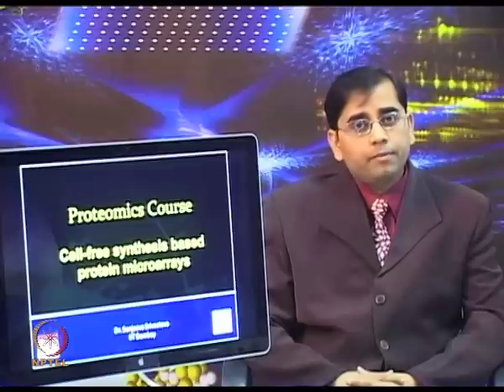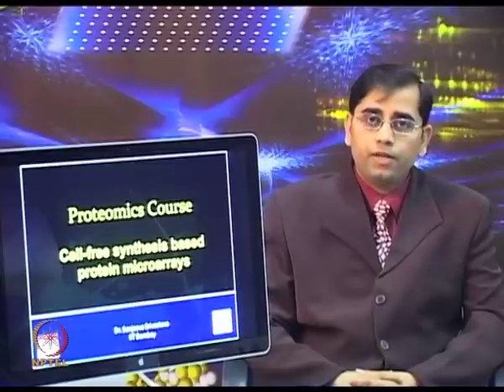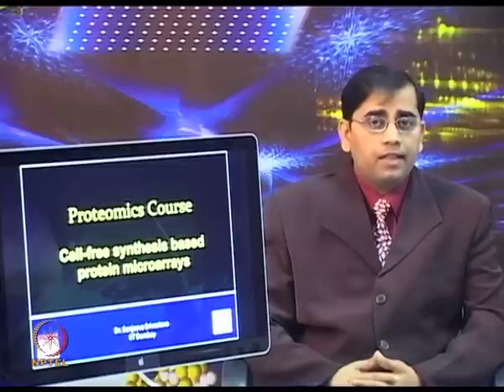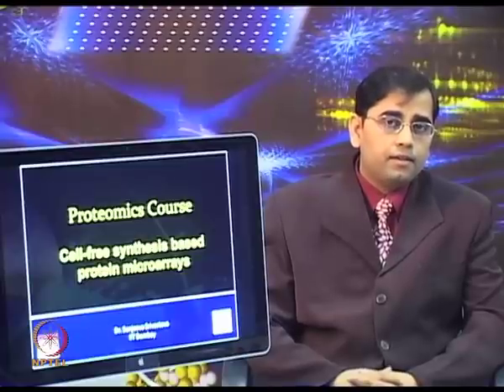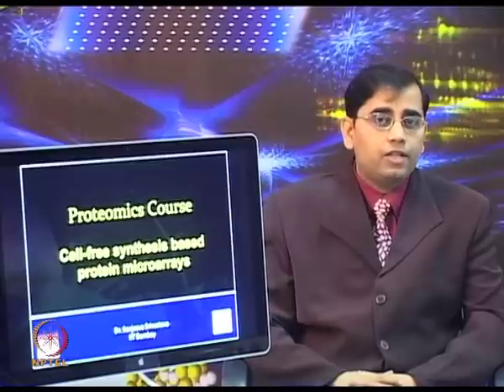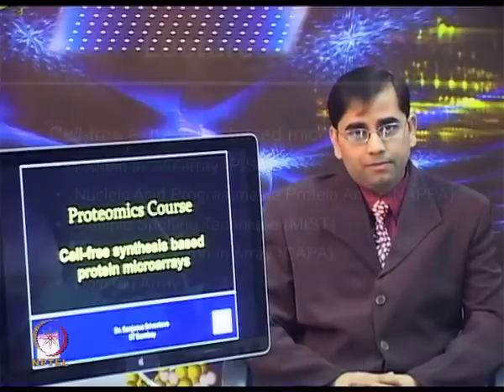The cell-free expression based systems overcome various limitations of protein purification and they perform in situ transcription and translation. During the last decade, various methods have emerged as a very strong platform for protein microarray generation by applying these cell-free expression systems.